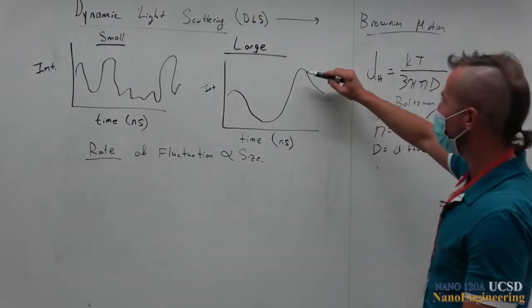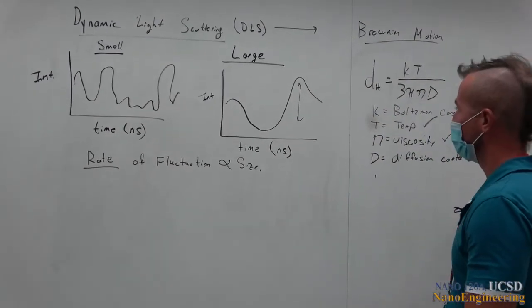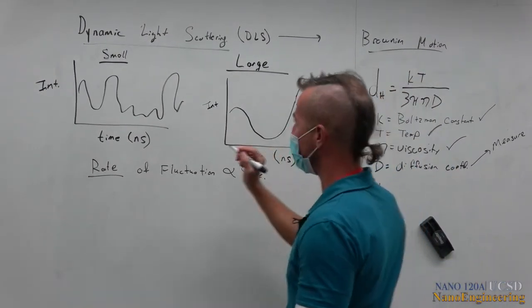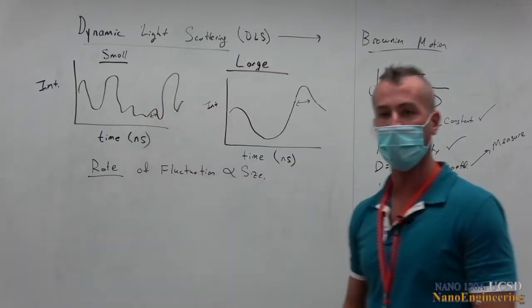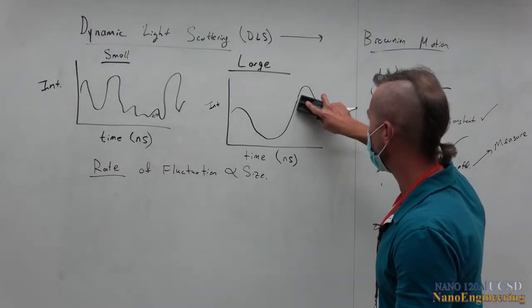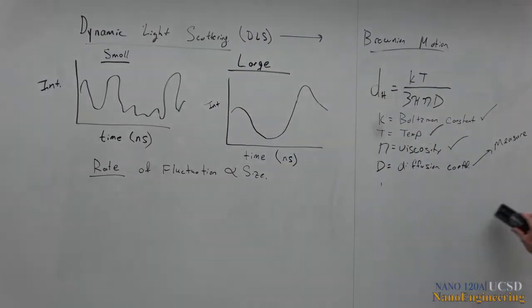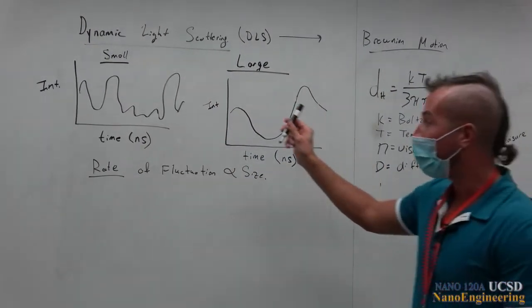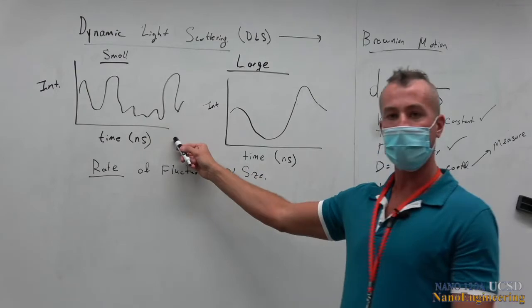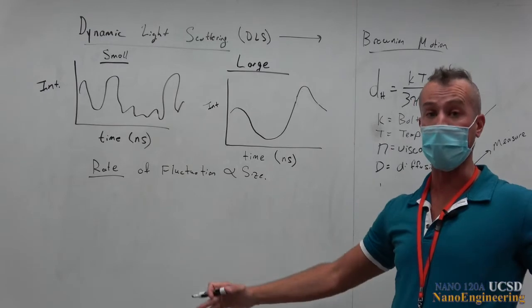Right? So don't look so much at the magnitude. What you're kind of looking at is this. And see how you just kind of have more narrow peaks here on your small than your large. Okay. This is actually the first step. Now, what you're going to do is keep collecting this nanosecond scale spectra again over many seconds.